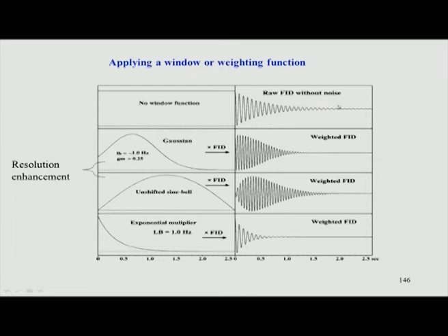What it means is that your resolution, that is the separation between the peaks, appears on this side more than what appears on this side. So, if I want to get a better resolution, my emphasis or weightage or importance should be given to this part of the spectrum rather than this part, and that is again done by using different mathematical functions, that is the window functions. You can look at this kind of a function here. What is happening here, if you see, is that it is giving very less weightage to this part.